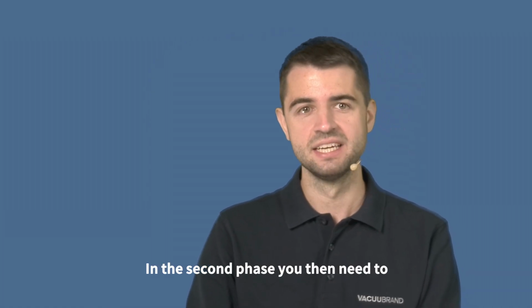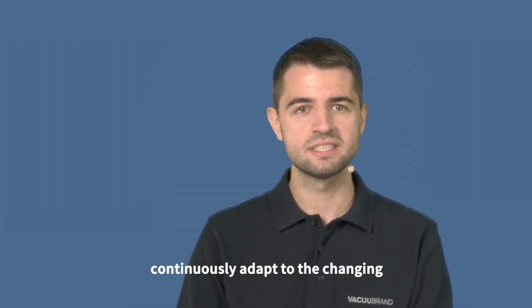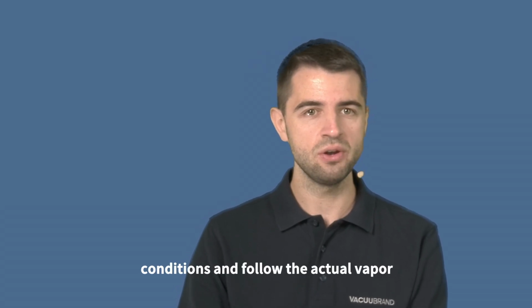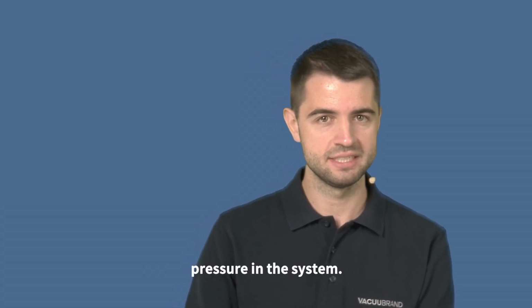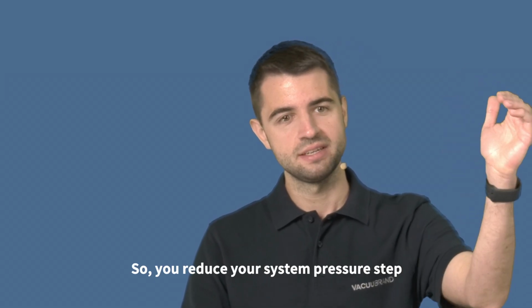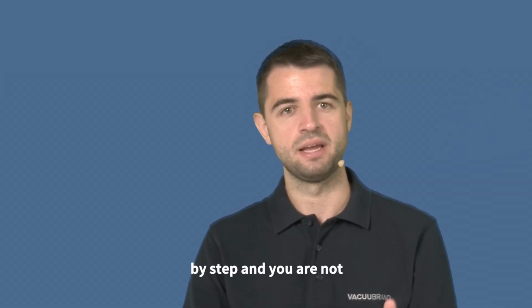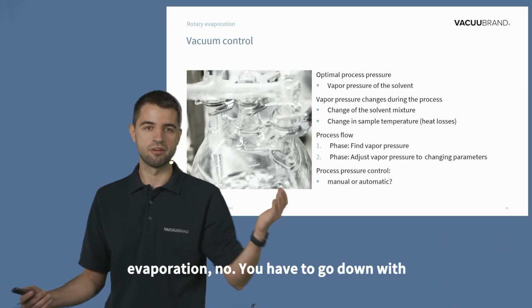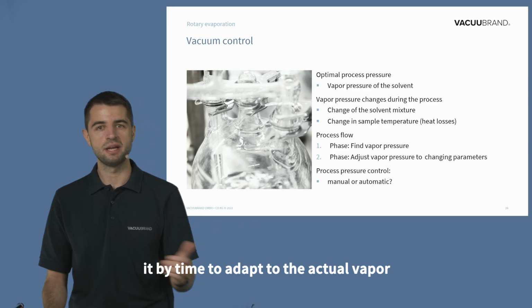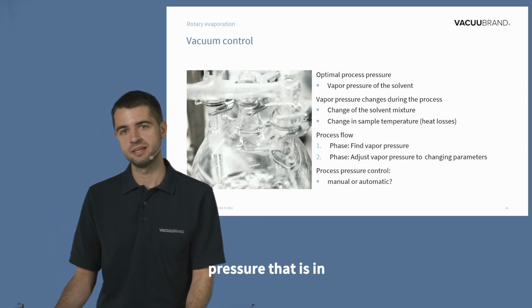In the second phase, you then need to continuously adapt to the changing conditions and follow the actual vapor pressure in the system. So you reduce your system pressure step by step, and you're not holding it at a certain level, the first level where you witnessed evaporation. No, you have to go down with it over time to adapt to the actual vapor pressure that is in your system right now.